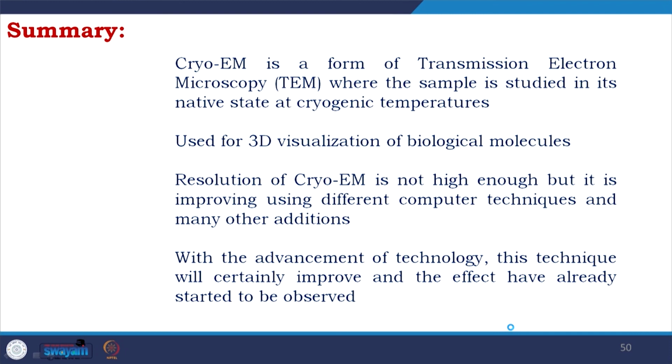In the next class, we will talk about the story of how the advancement of cryo-electron microscopy happened from the 1970s, started at the initial stage, and how one innovation after another has contributed towards high resolution, starting around 100s to 50s of angstroms resolution.